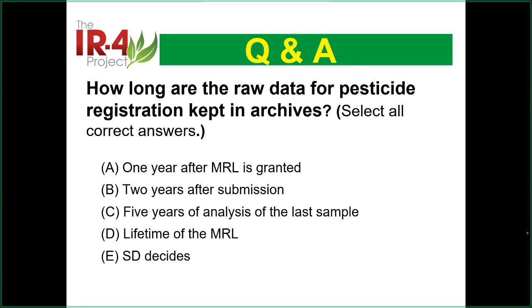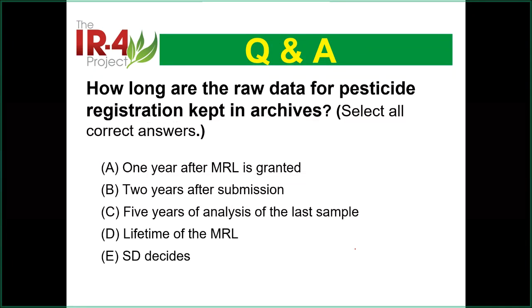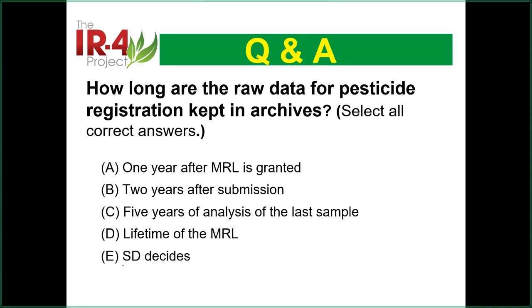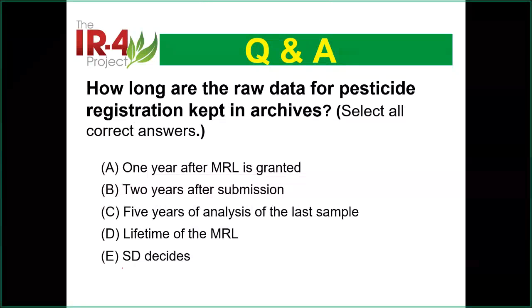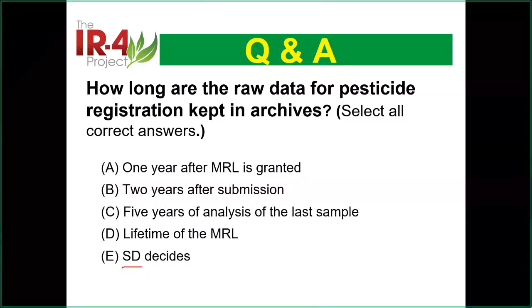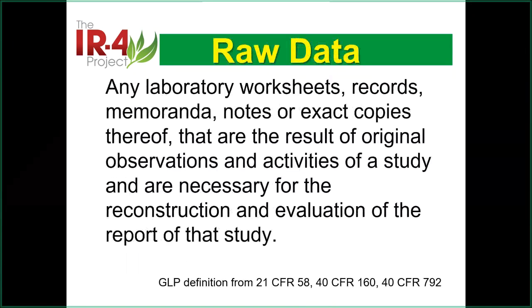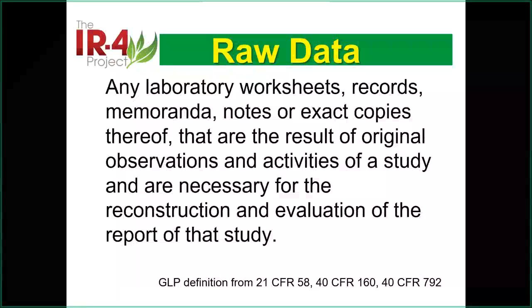And from which point do these 5 years, 3 years, 1 year, 2 years start? Or sometimes, because this is a GLP study, the study director can say, yes, keep it, or simply dispose of whatever you have. Those are the questions. We spent a little bit of time, but that's good learning. We will do this at the end of the training if we have the time.